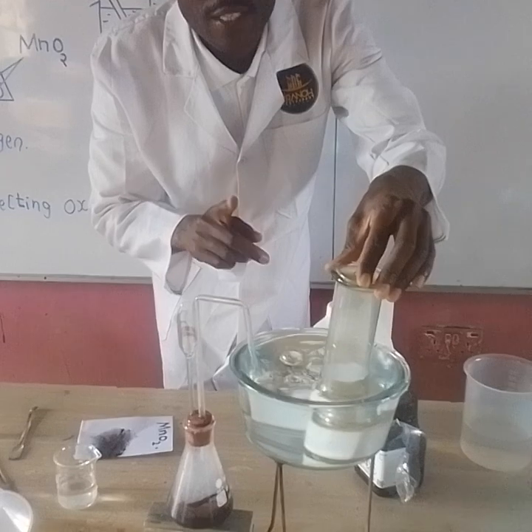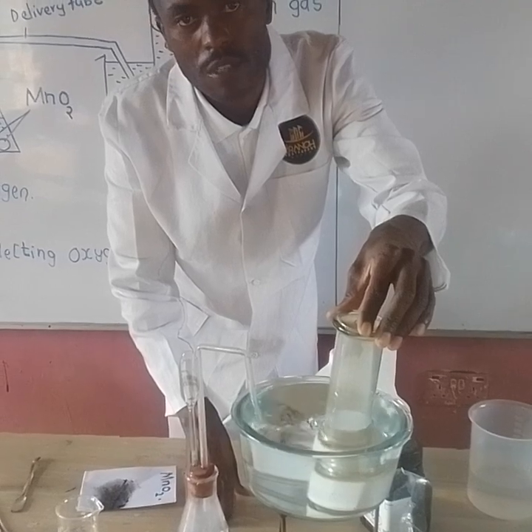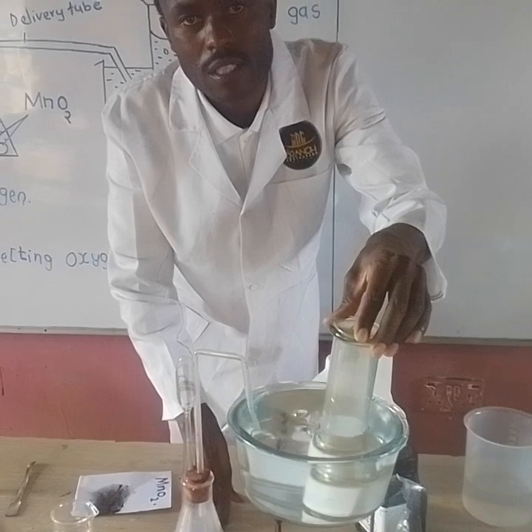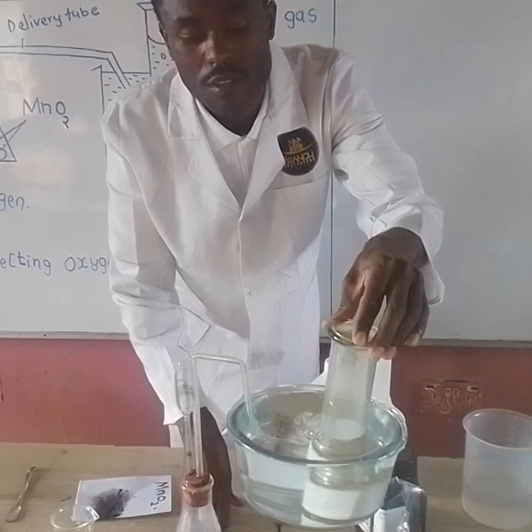And my student, the reason why we collect oxygen over water is because oxygen is slightly soluble in water, or we can as well say oxygen is insoluble in water, but the solubility is very slight, so slightly soluble in water.